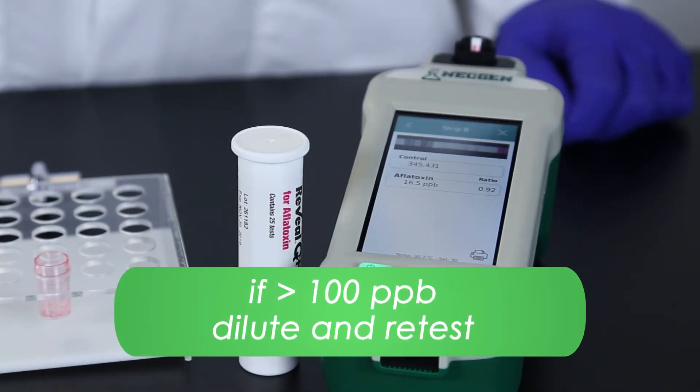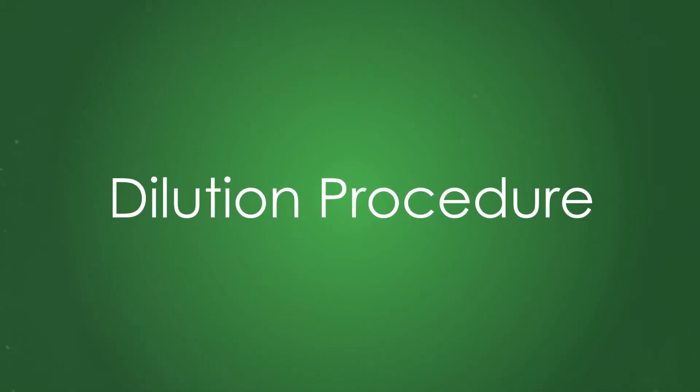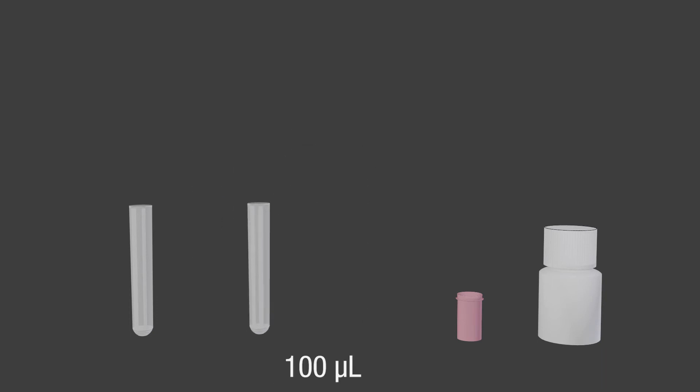For samples greater than 100 ppb, you will need to dilute and retest. Add 100 microliters of sample filtrate to a sample collection tube. Add 100 microliters of 65% ethanol and mix well. Transfer 100 microliters of the diluted sample to a red dilution cup. Add 500 microliters of sample diluent and mix well.